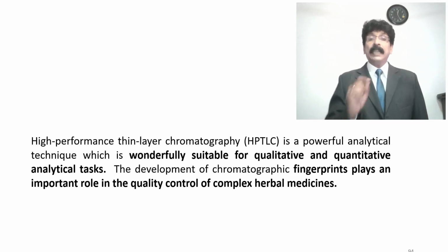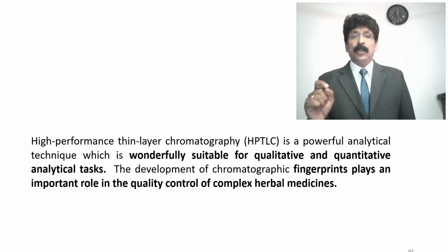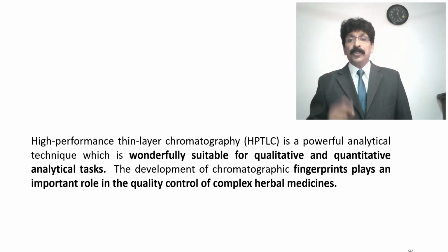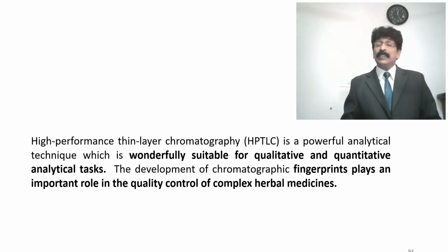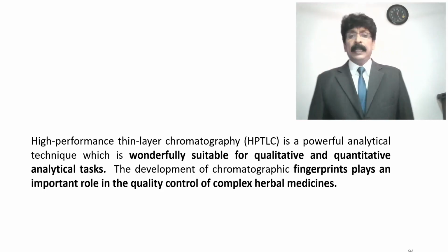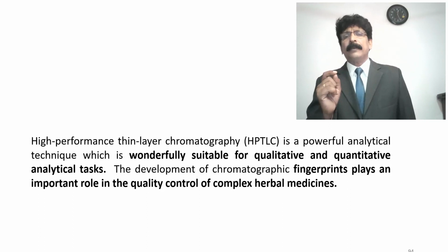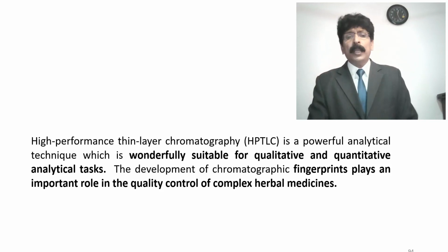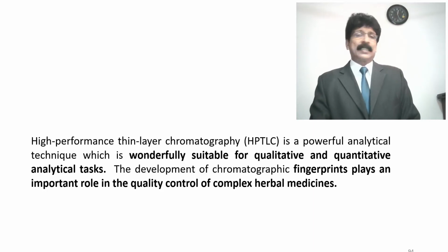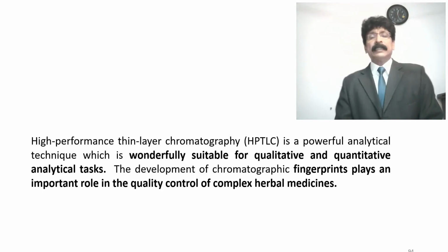High performance thin layer chromatography, that is HPTLC, is a powerful analytical technique which is wonderfully suitable for quantitative as well as qualitative analytical tasks. The development of chromatographic fingerprinting plays an important role in the quality control of complex herbal medicines. Complex herbal medicines are an important task for herbal formulation manufacturers and even users and consumers.